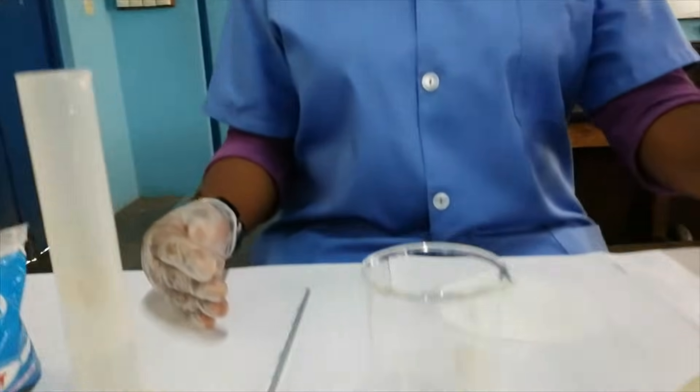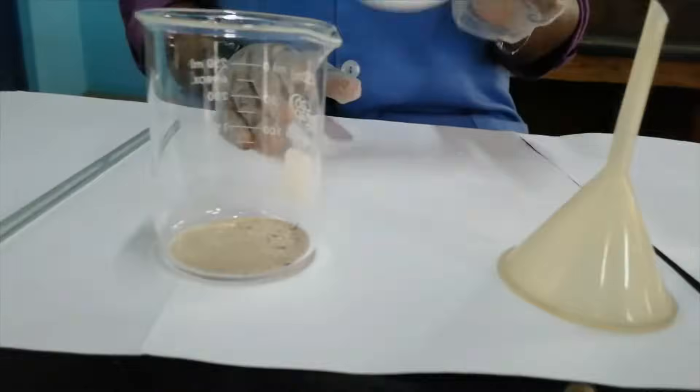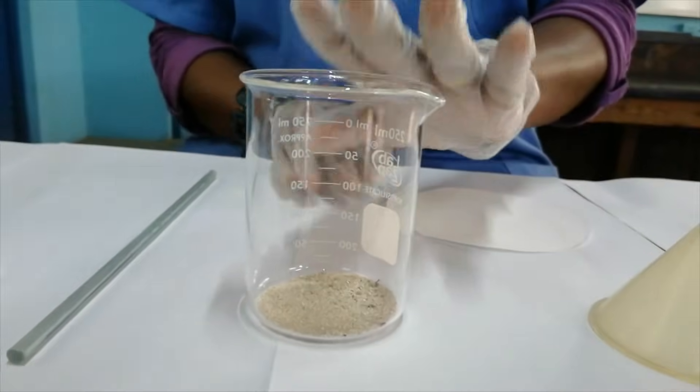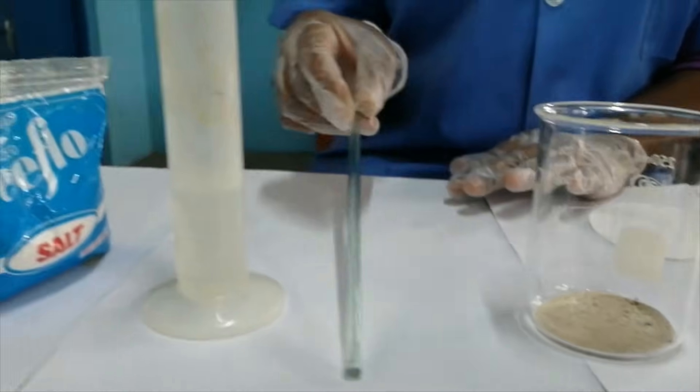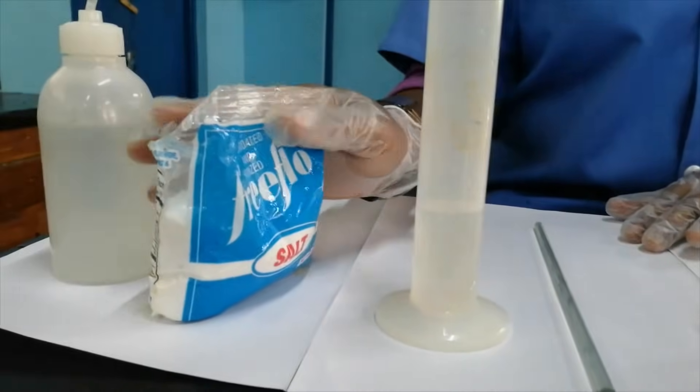Everyone, today we're going to separate a mixture of sand and salt. So let's look at the apparatus and materials that we'll be using. We have a conical flask, filter funnel, filter paper, the beaker with the sand, a glass rod or stirring rod, a measuring cylinder, and our wash bottle.